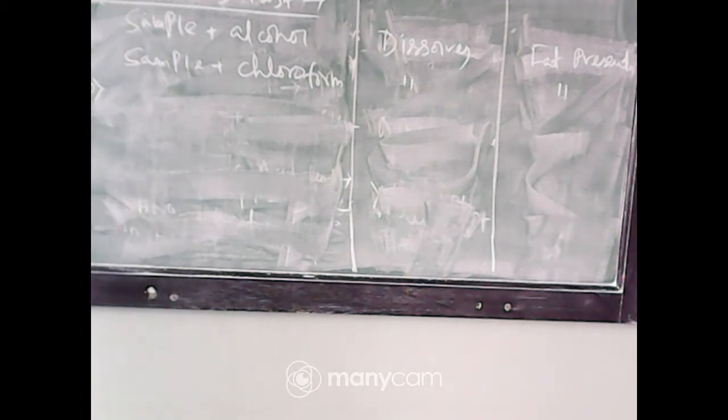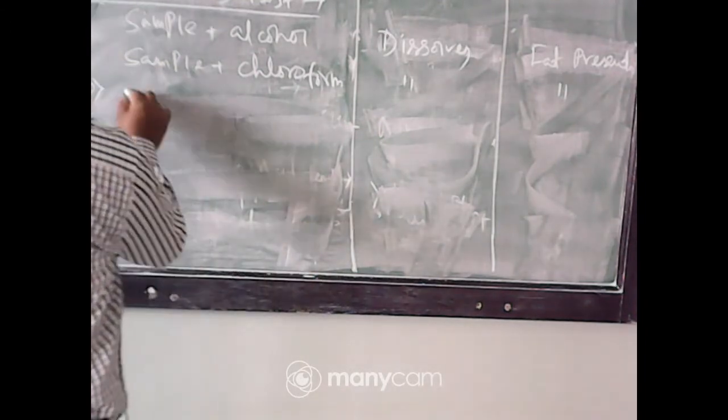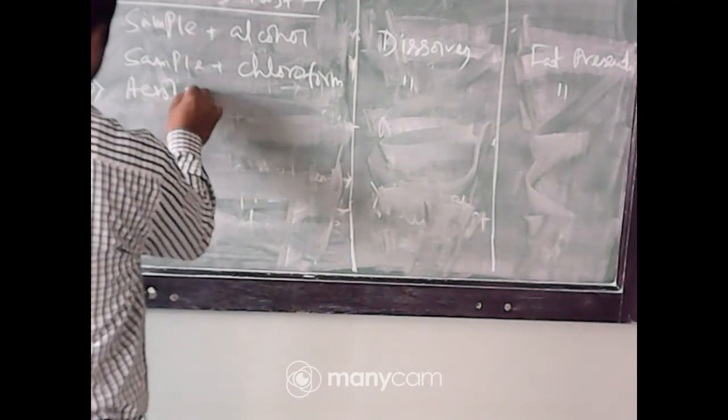Acrolein test. There is also the translucent spot test, Hubl test, etc. The acrolein test is simple. The smell, the fumes coming out, are poisonous, that is of acrolein. So this is the acrolein test.